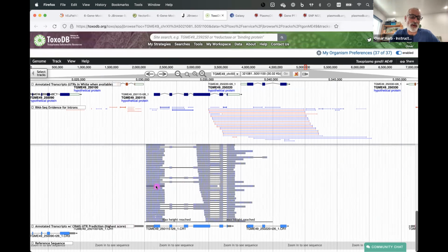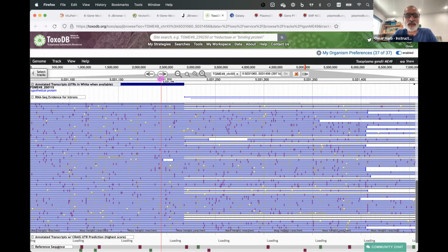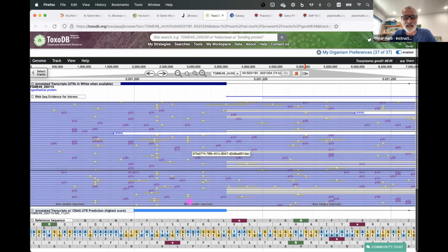One thing we can say is, can we actually take a look at this? We do have a track called the reference sequence track, which includes the nucleotide sequence. It might take too long to do right here, but you can zoom in to this region specifically until you are able to see what the data looks like. Let's see if this will work. I'll just do one attempt, and if it doesn't work, we can ignore it for some other time.